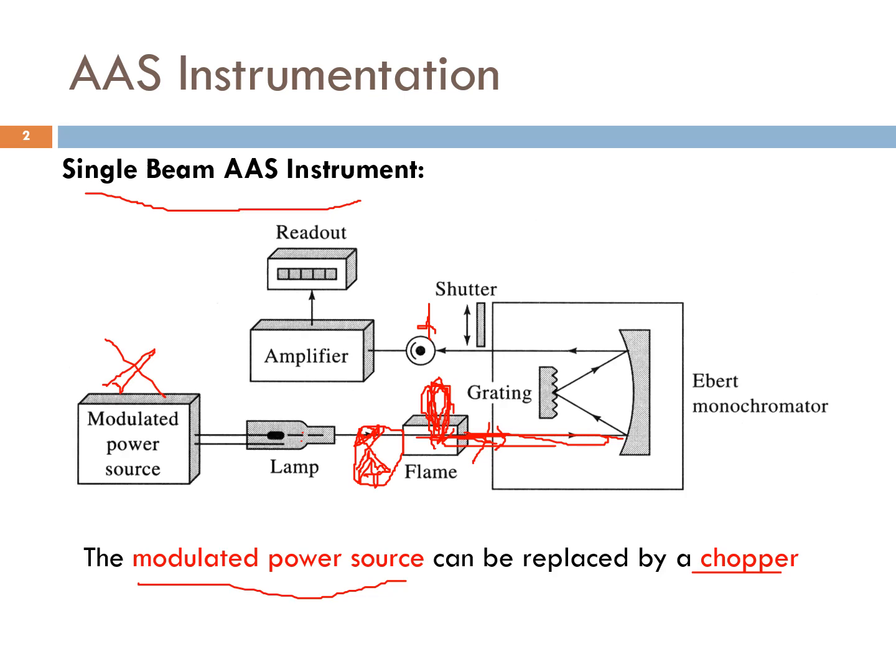Okay, mechanical chopper. So maksudnya bila lamp ni kena dekat yang opaque tu, automatically radiation daripada lamp ni tak akan kena the flame. So masa itulah emitted radiation from the flame due to the analyte and due to the flame species akan detect oleh detector. Masa itulah dia boleh tolak both the radiation from the lamp and flame, tolak the radiation emitted by the flame sahaja. Sebab apa? Sebab apa yang kita nak, the absorption of our metal of interest, absorption of the light here.